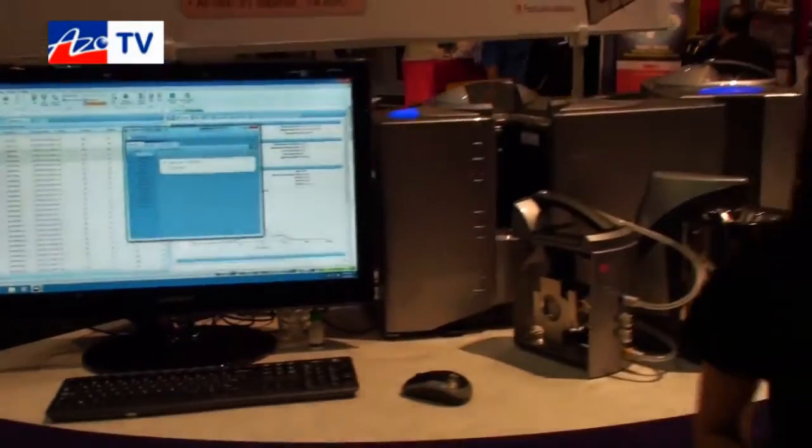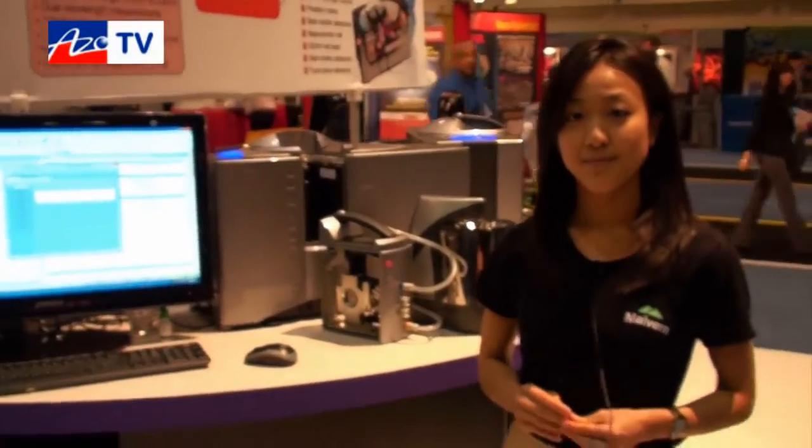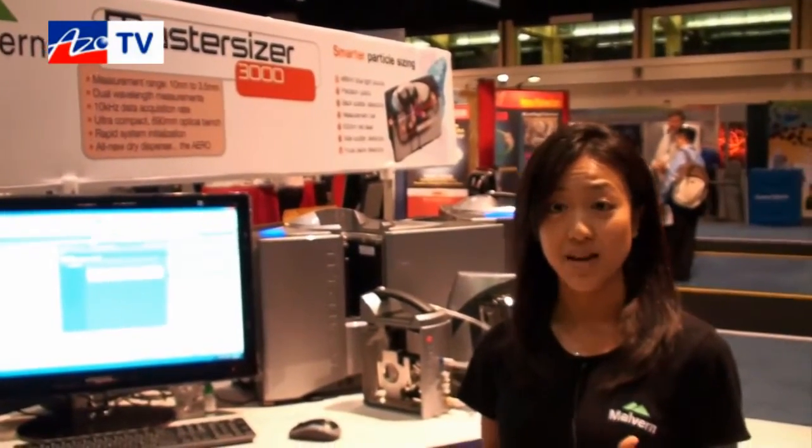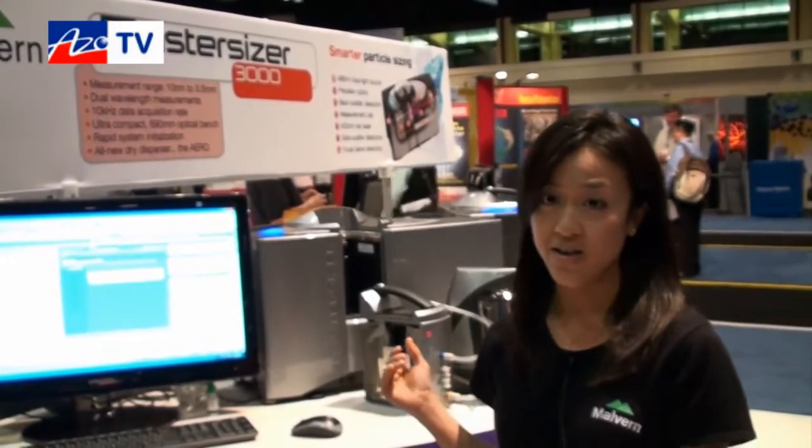What particle size range does the MasterSizer 3000 cater for? It's broad — it goes from 10 nanometers to 3.5 millimeters. It also has a high data acquisition rate of 10,000 snapshots per second. Whether you work in pharmaceutical companies with very limited sample amounts, or in coatings, metals, food, or cosmetic industries, we have a wide variety of configurations suitable for your application.